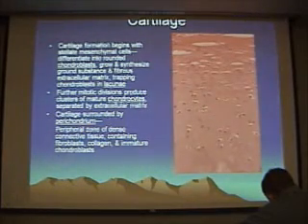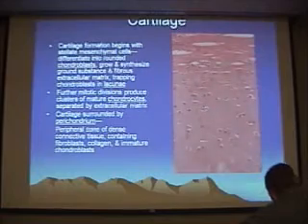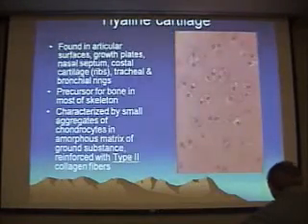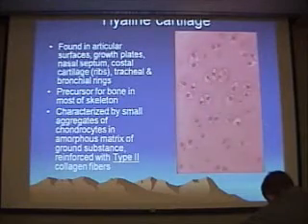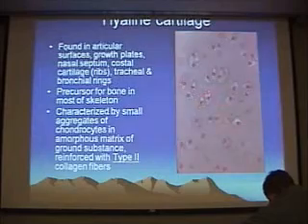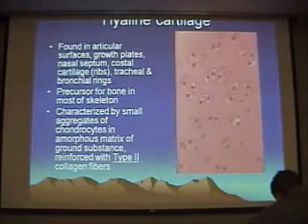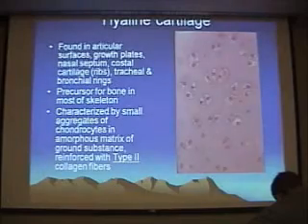These chondrocytes are often found in little clusters called isogenous groups. That's just, remember, because of the way they grow, as they continue to divide, they form these little clusters, so they're often bilaterally symmetrical. So those are just the little isogenous groups of the chondrocytes within their lacunae.